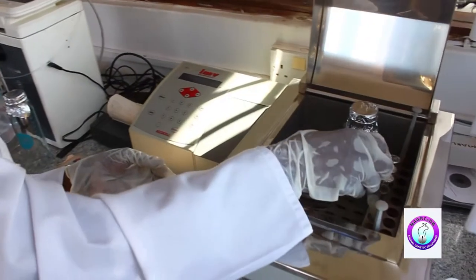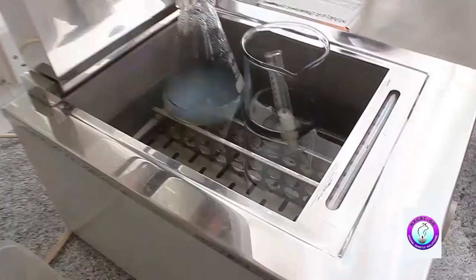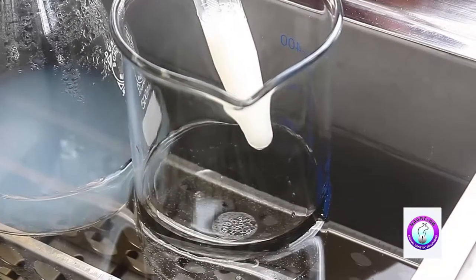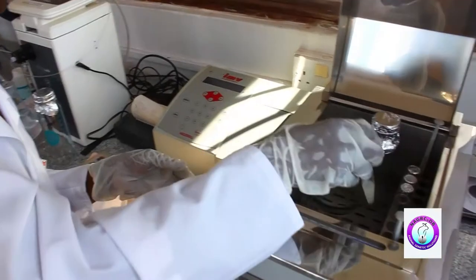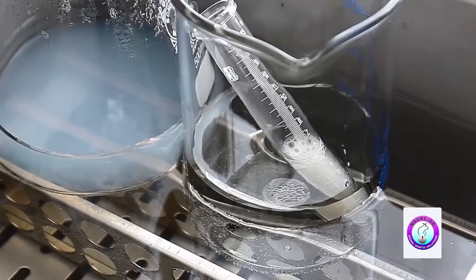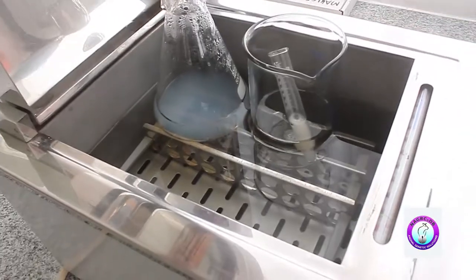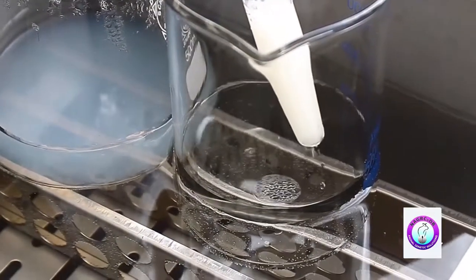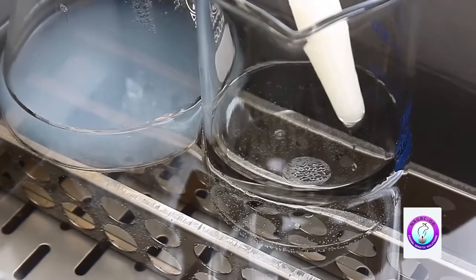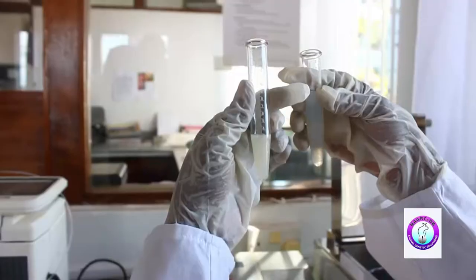Where we are going to put the semen immediately it comes in, to maintain that temperature. And when we bring the semen, we put it at 33, 34 degrees Celsius. Therefore, if there is a green color, we consider the sample dirty and we discard it. If there is a yellow color, it means the bull has a wound and produces pus. Therefore, we start caring for the bull because we must treat it from the injury, from the pus. We treat it to heal, and still the sample will be discarded because it will be considered dirty.